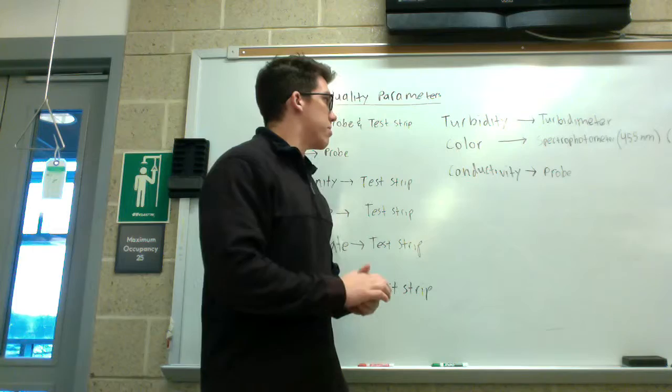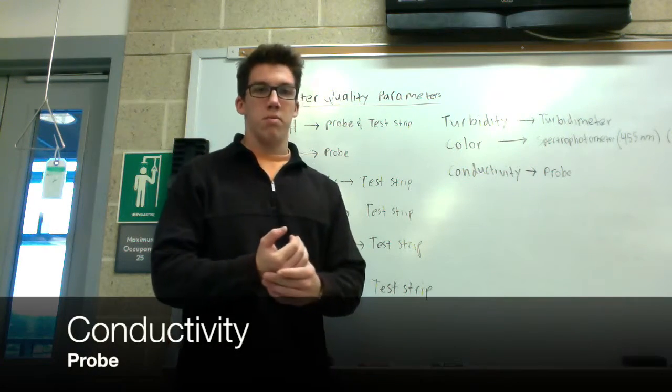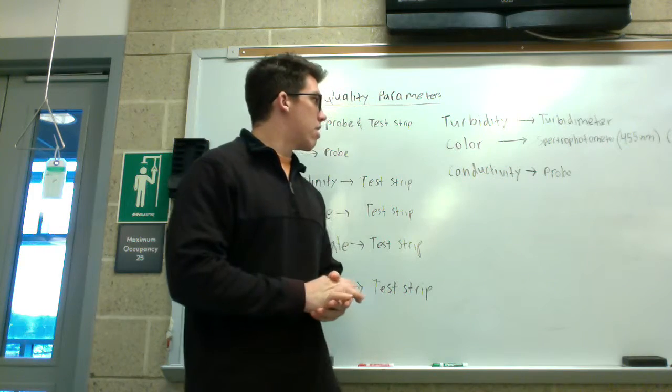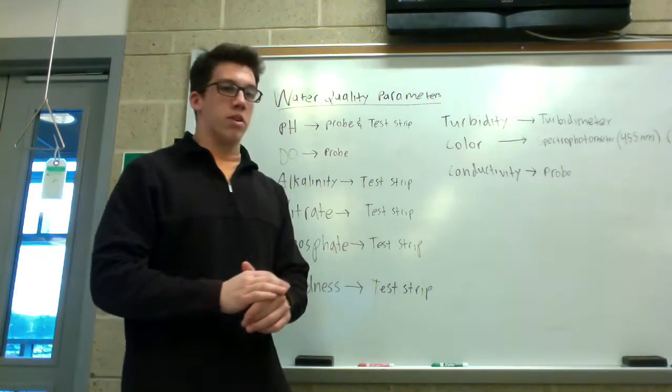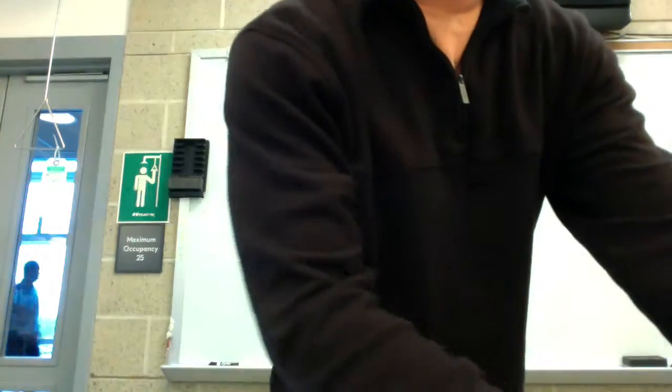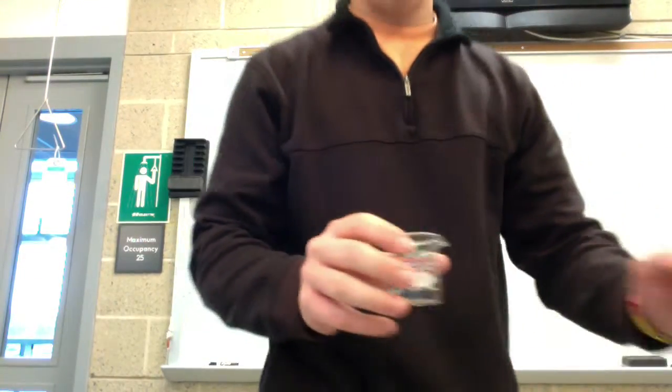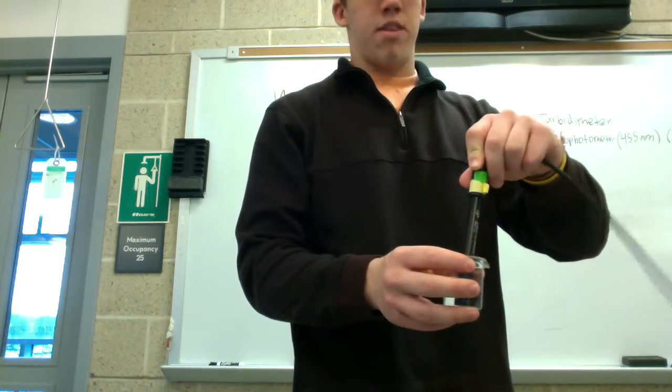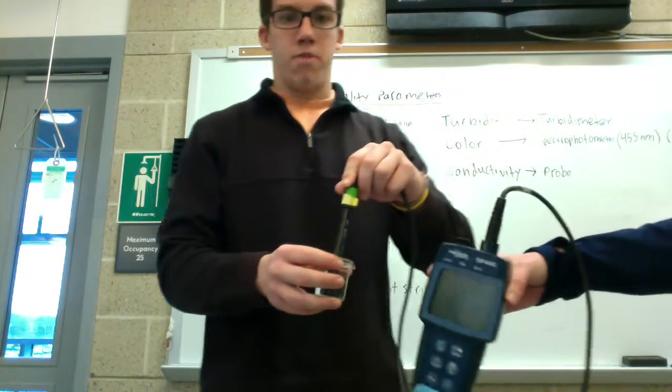The final parameter we're testing for is conductivity. Conductivity is a measure of all the anions and cations present in a water sample. We're going to use a conductivity meter. Take the probe and put it into your water sample. Once it stabilizes, you'll have a conductivity value.